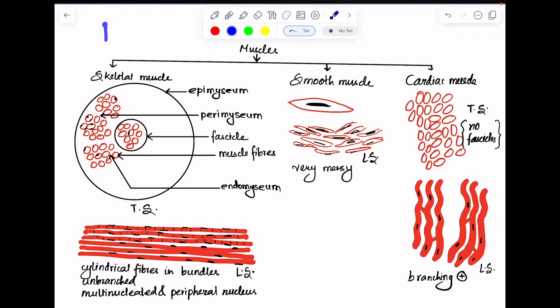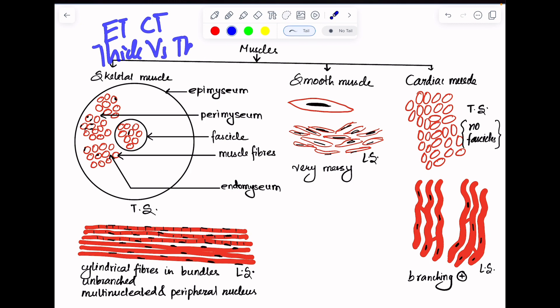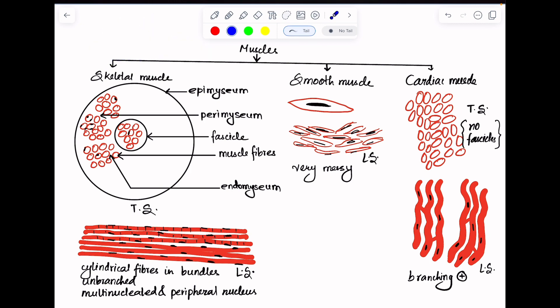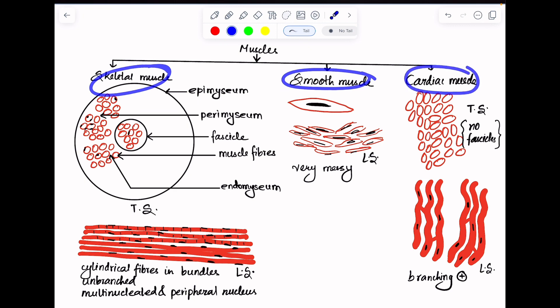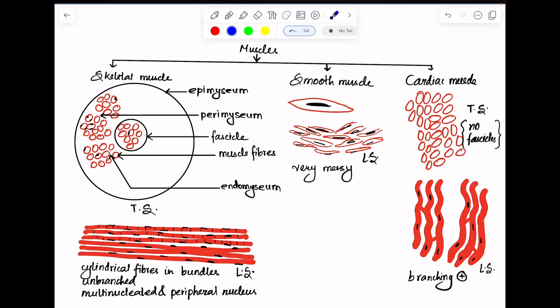We are already done with epithelial tissue, connective tissue, thick skin versus thin skin. Now let's look at the histological slides of skeletal muscle, smooth muscle, and cardiac muscle. I'm going to get directly into the tricks that you need to know to identify each of them.